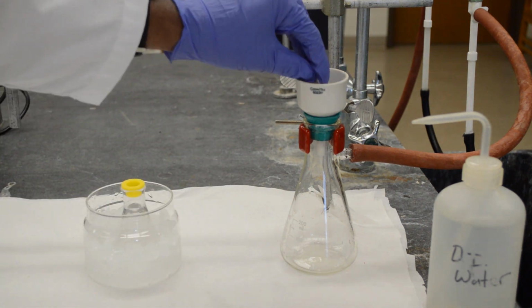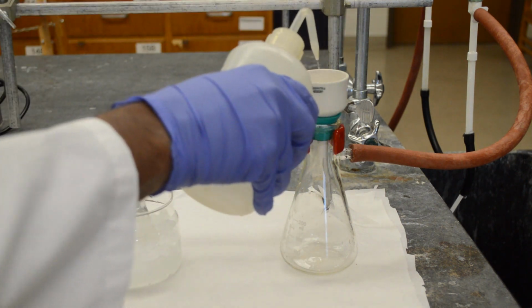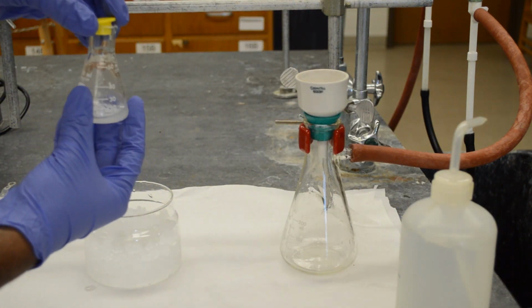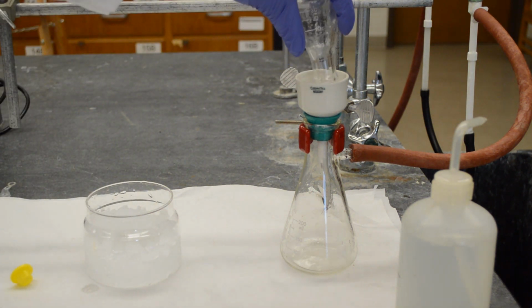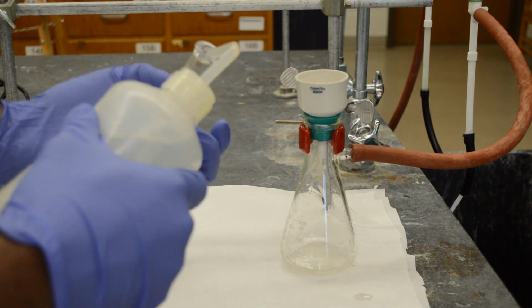With a filter paper, wet the filter paper with DI water and add your product. Rinse the flask with DI water.